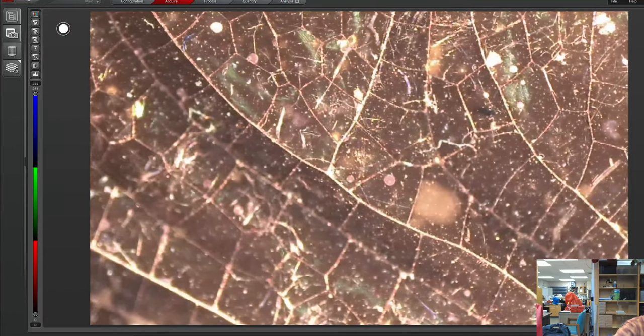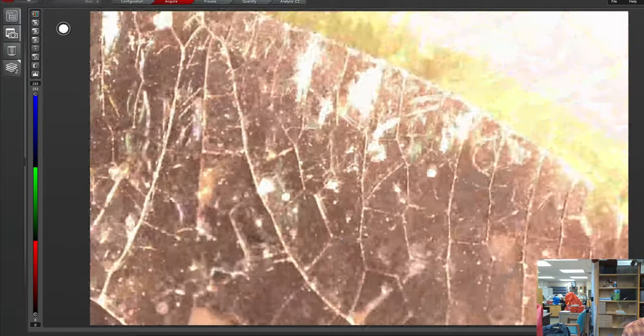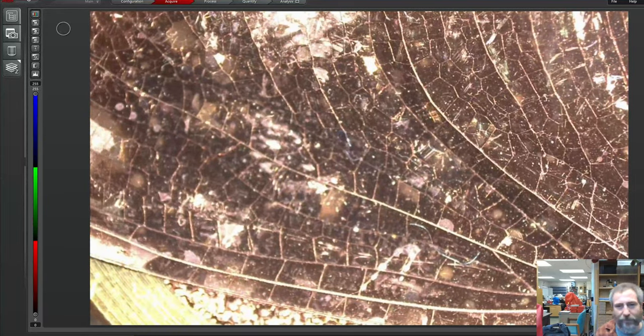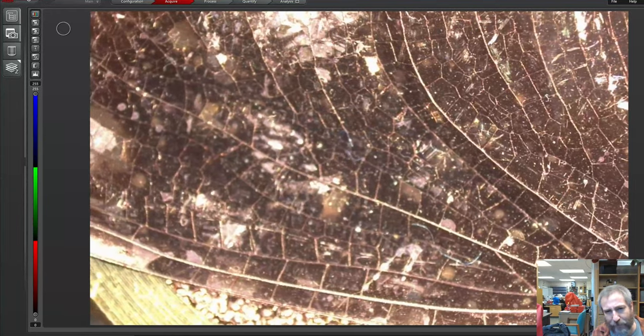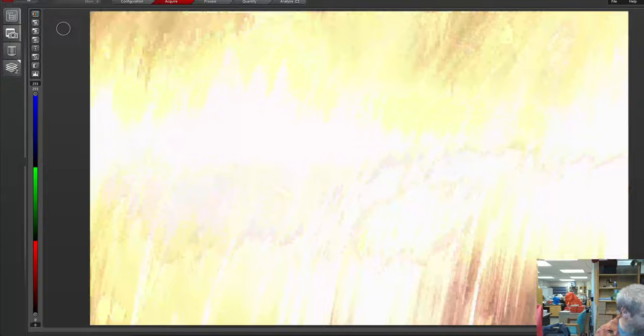And sometimes I'll put it back in when people are around, like science night, when we have the public come by and look at stuff. Sometimes I'll put the dragonfly head and its wing back in. So we've had this on the SEM for public consumption before, for people to just kind of come in. If I just show them diatoms, they'll be like, I don't know what this is. So I try to give them some things that are a little bit more common that they might recognize.